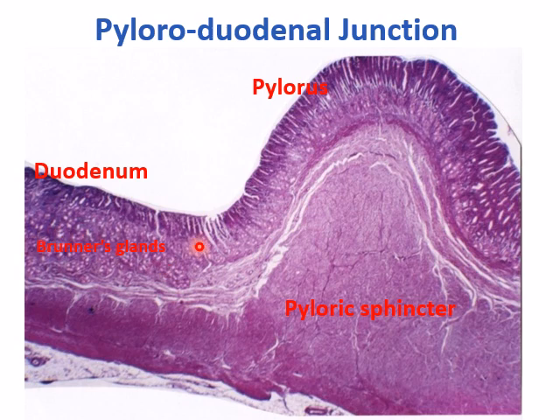So again, we have the slides of the small intestine. I should differentiate between the ileum and duodenum, and I have a long strip, the pyloroduodenal junction, but the pyloroduodenal junction is a data show slide only.